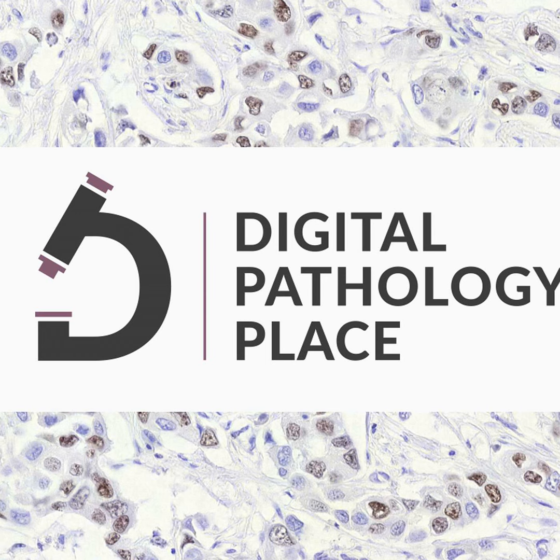on the screen, but also all the images that you've probably multiplexed as population studies. And so I think that data visualizations are really an important tool to be able to evaluate how good the phenotyping has performed, as well as to get some really exciting results out.